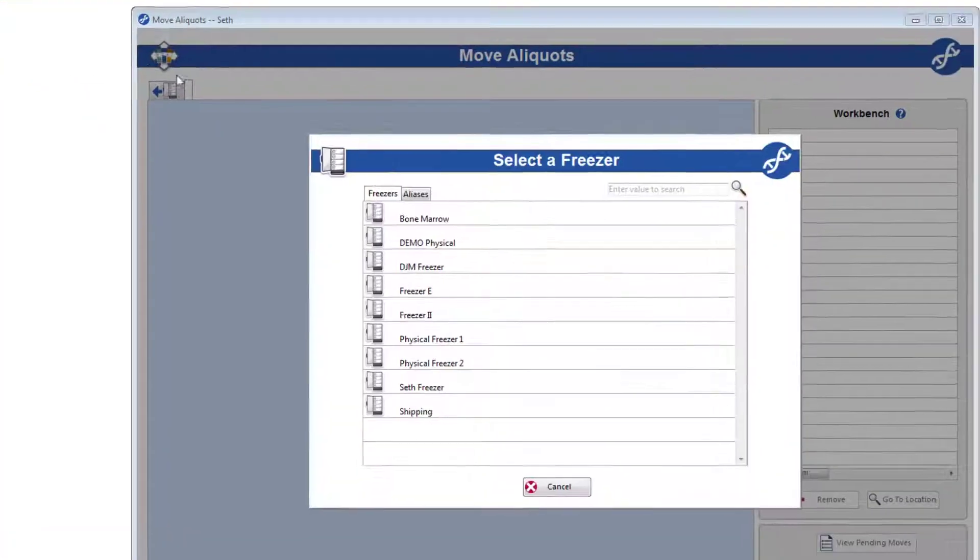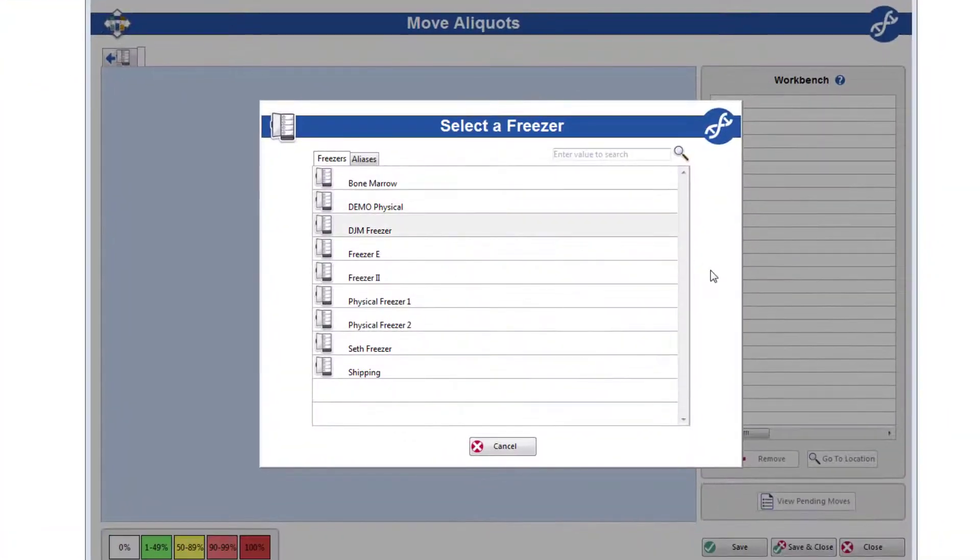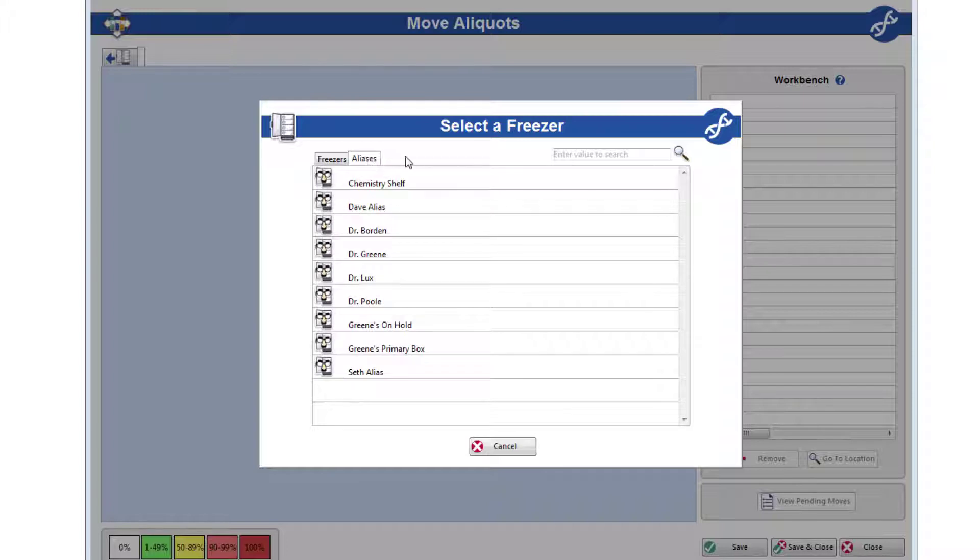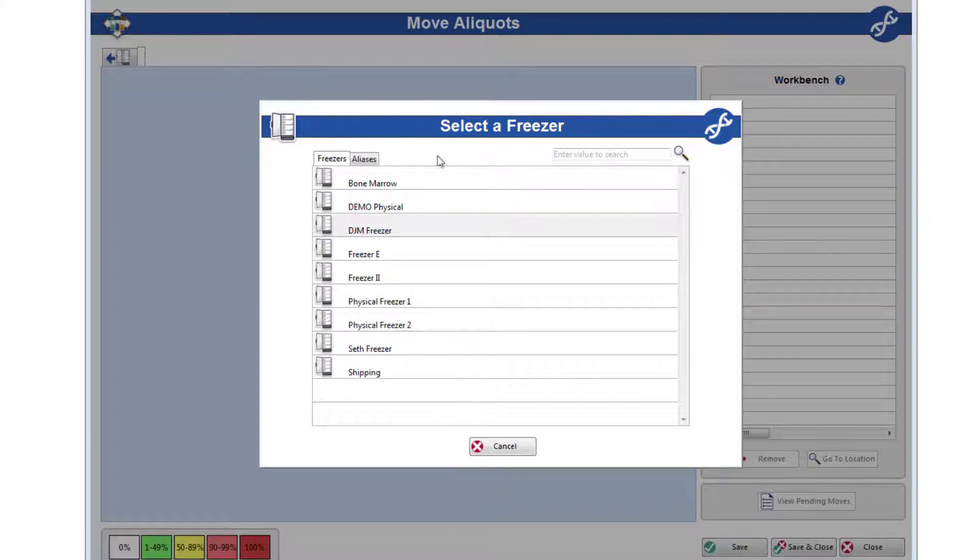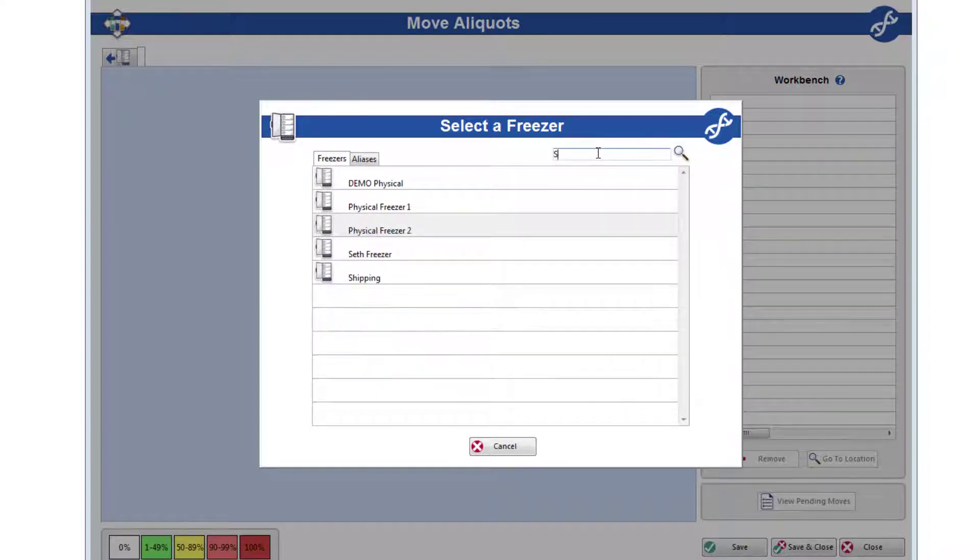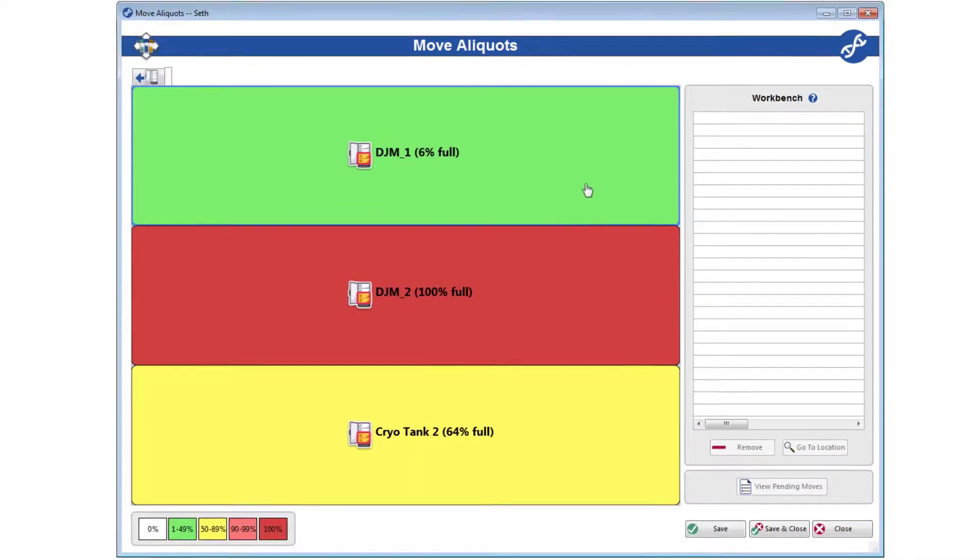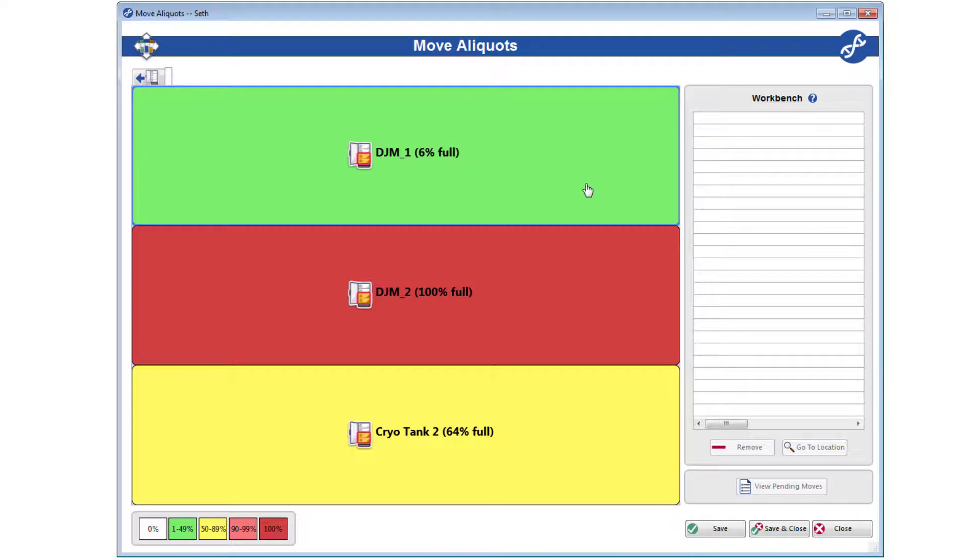To begin, you'll select the physical freezer you'd like to start moving from. You can also select the Aliases tab and start from a specific location instead. If you've got a lot of freezers or aliases, use the search bar here to quickly filter the list. Once you make your selection, the visual freezer picture will appear like so.